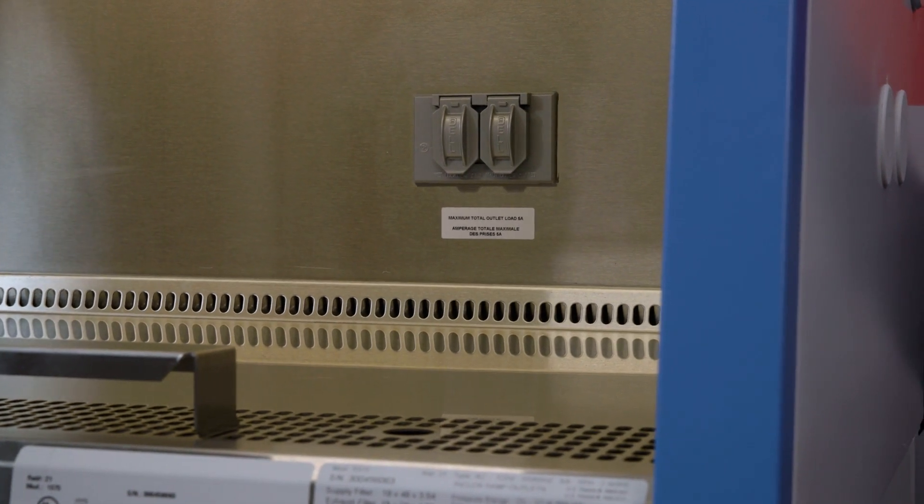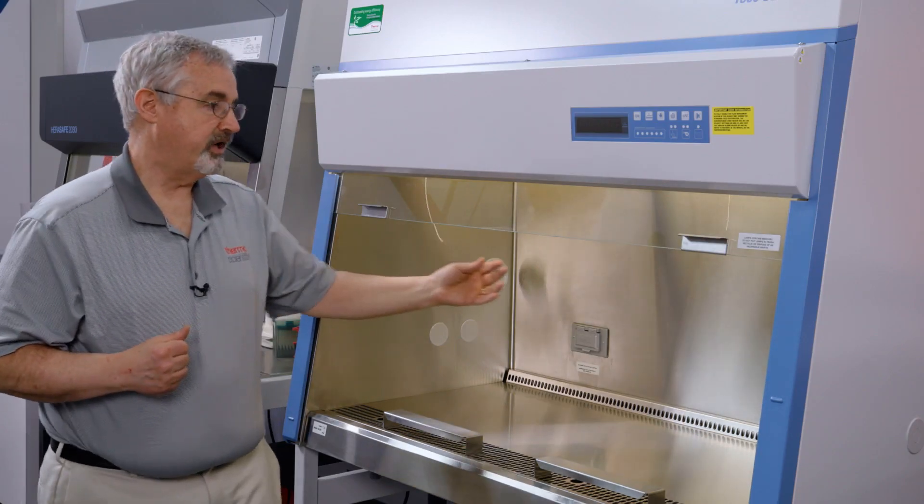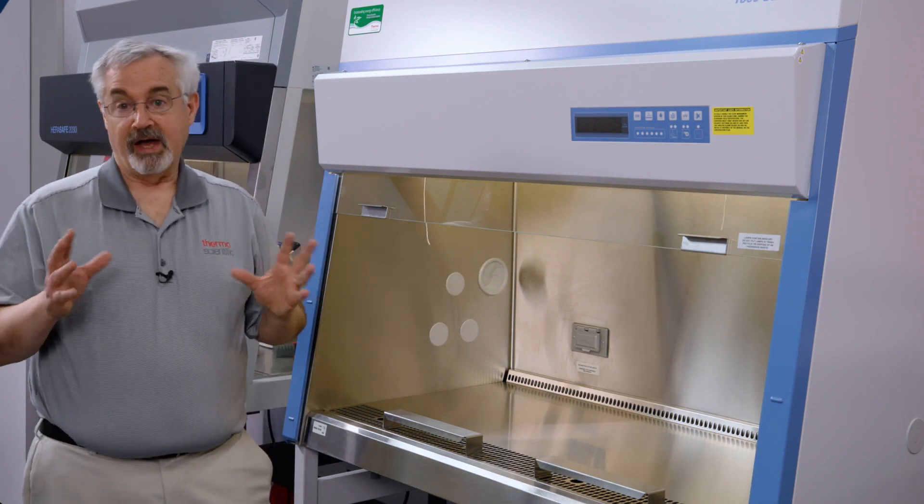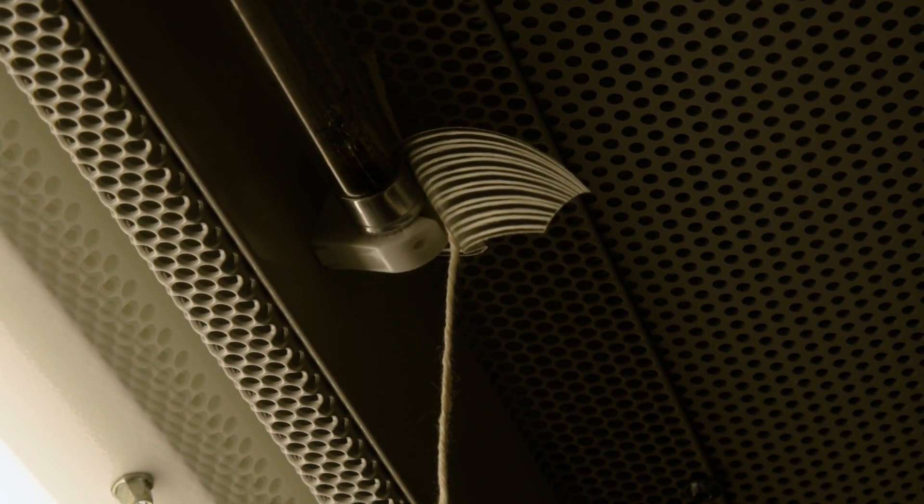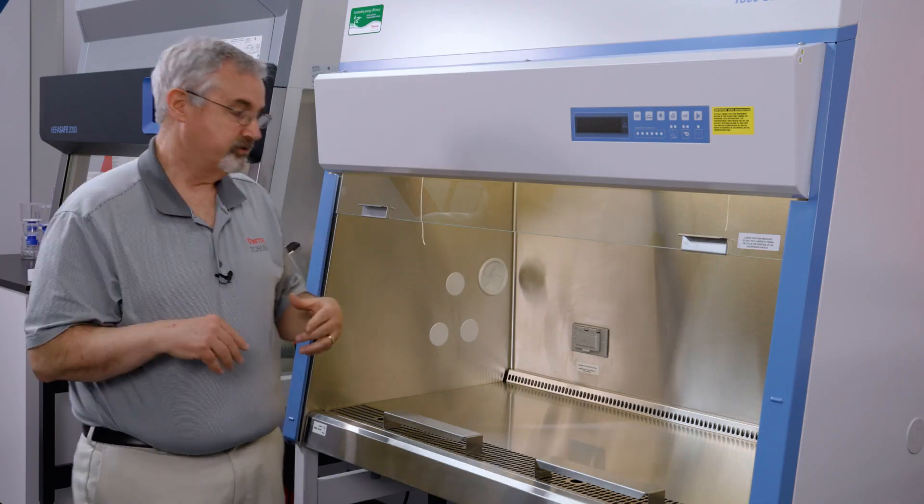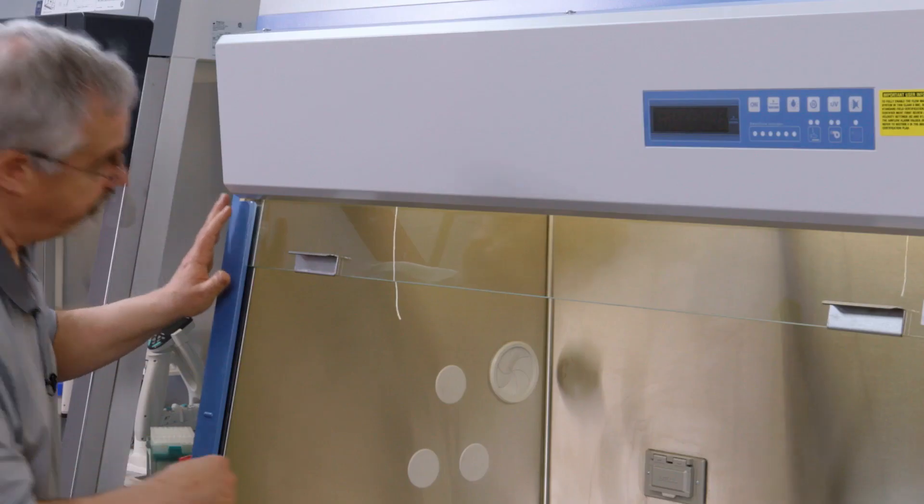There's two things we have to do still. You'll notice these two strings hanging down. They are to remind us that there's small bits of tape holding the UV germicidal light in place for shipping. So for units with UV you will find these and now we'll remove that.